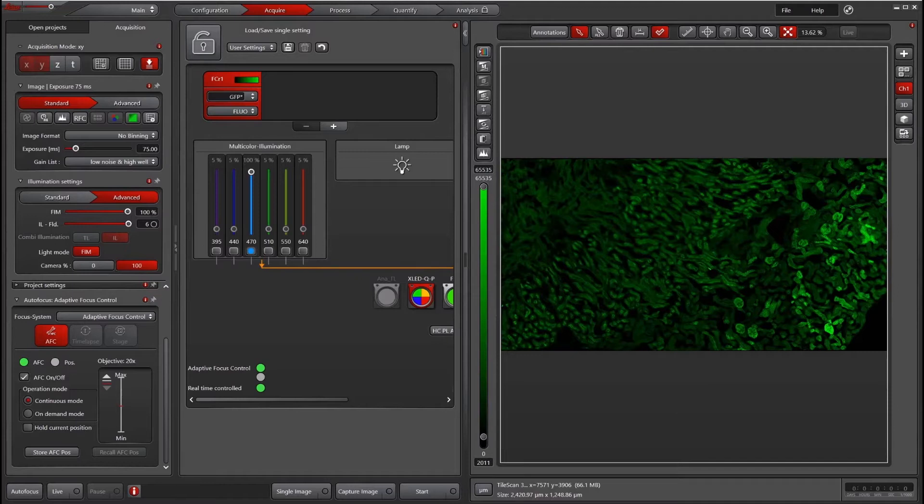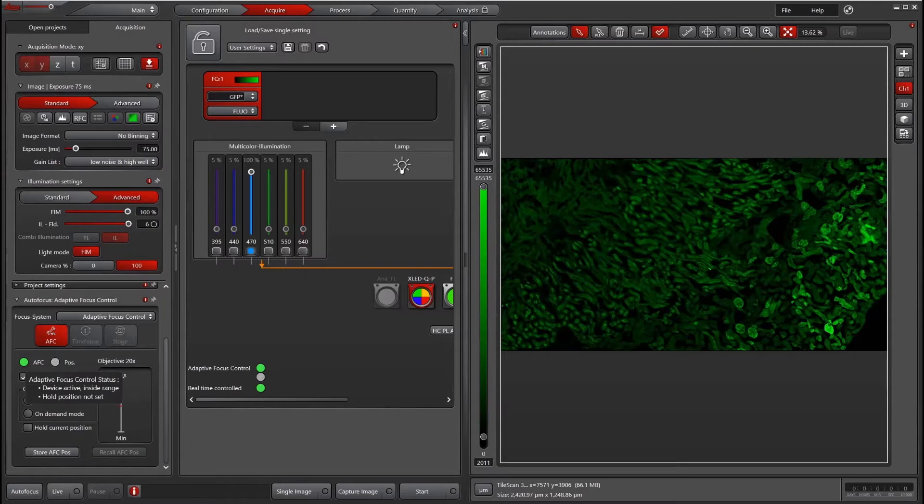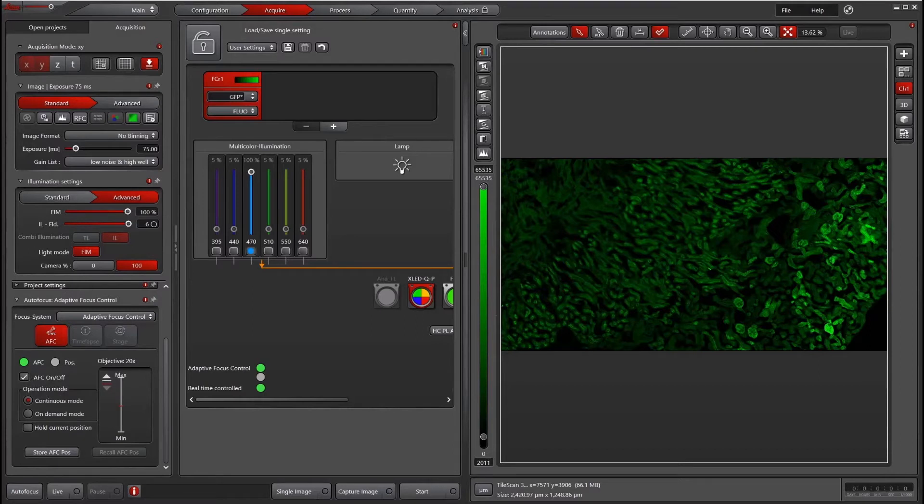Now, there are a couple of things that will work with AFC and won't work with AFC. One is that not all microscope objectives are AFC compatible. If this light is green, then you're good to go. If you are not using an AFC compatible objective, this light will not be on.